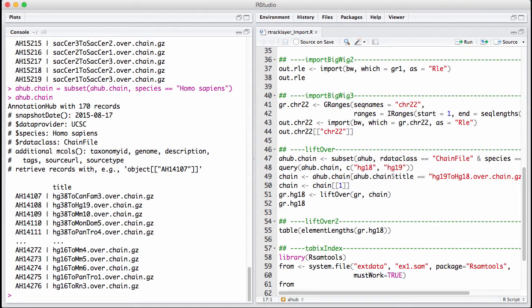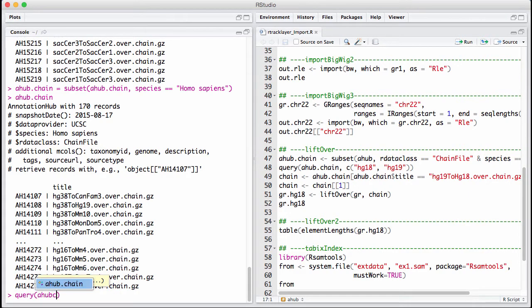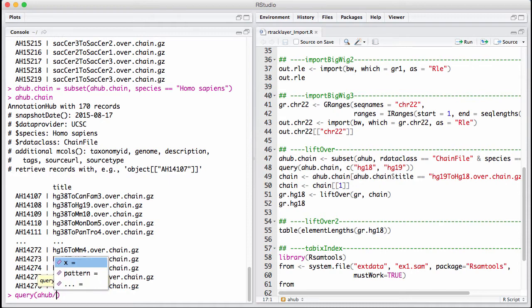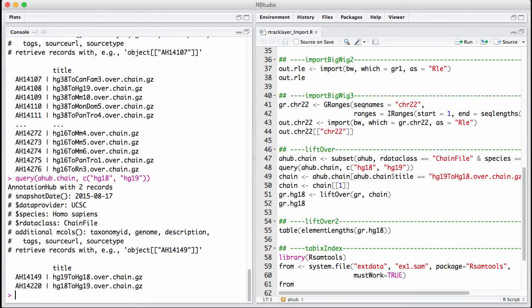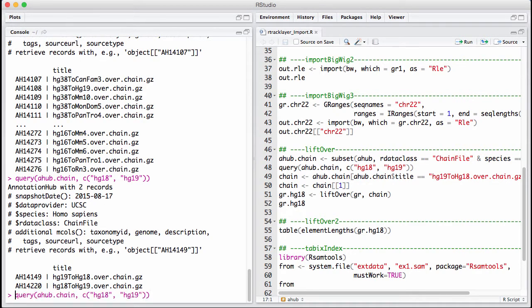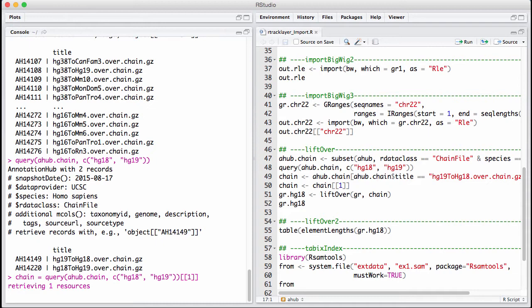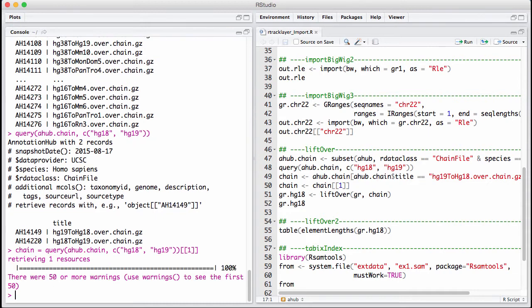Now, let's get the LiftOver chain from hg18 to hg19. So let's do a query of this ahub.chain. We're going to look for hg18 and hg19. If we want to convert hg19 to hg18, we want to get the first one of these two here. So now I'm downloading it, and I have the chain.